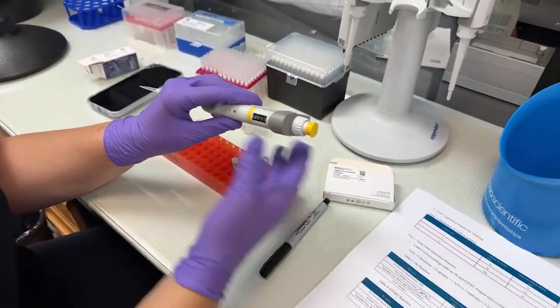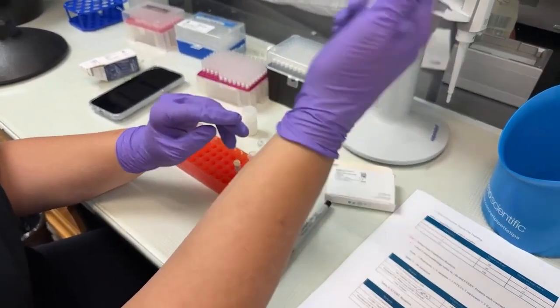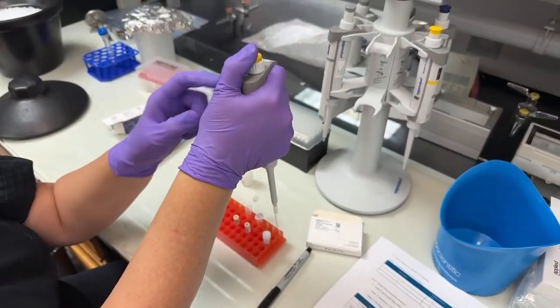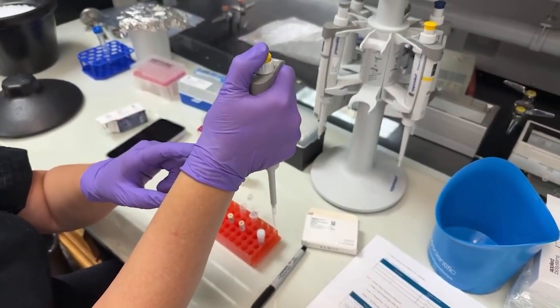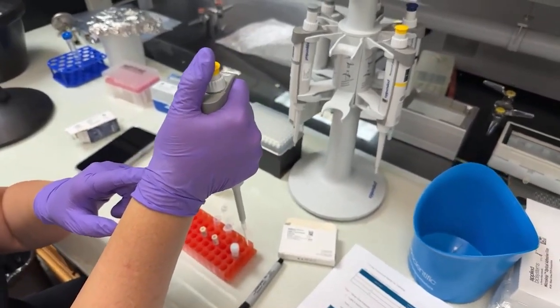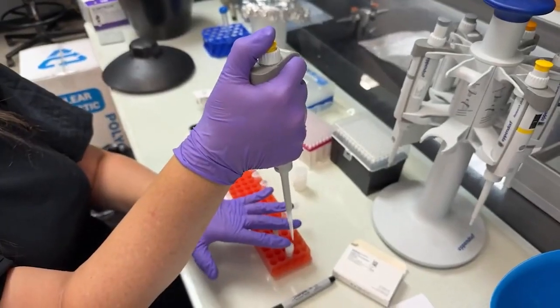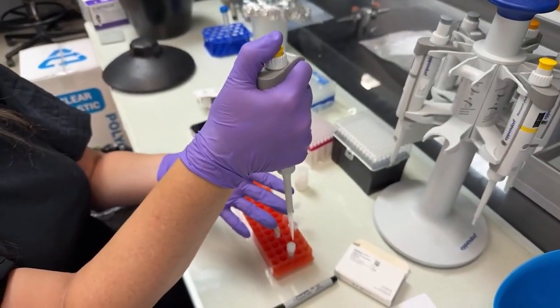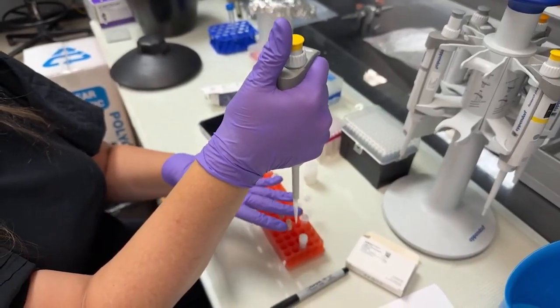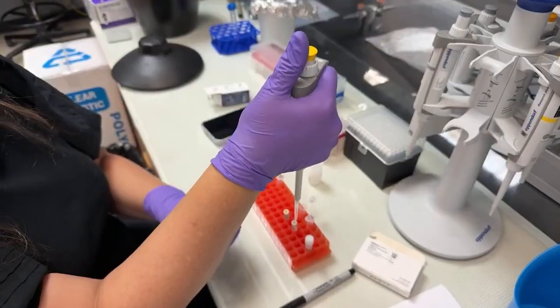To use it, if I'm going to pick up 75 microliters, I'm going to take that tip and depress till I get to the first stop. I can go a little bit farther if I push past the resistance. So what we're going to do is go to the first stop. That expels the air from inside the pipette. Then I'm going to slowly release that while my tip is inside the solution. That's going to allow me to pick up exactly 75 microliters.